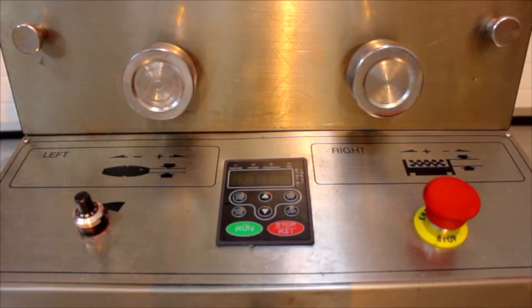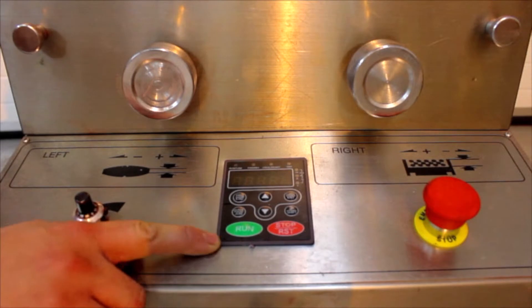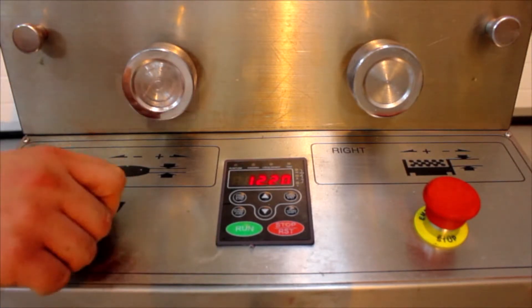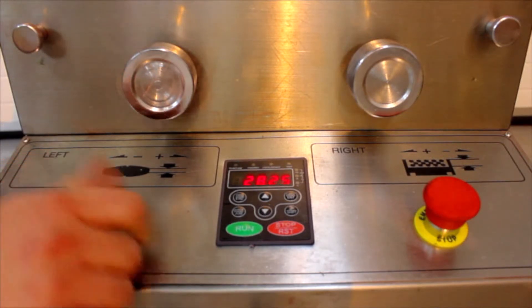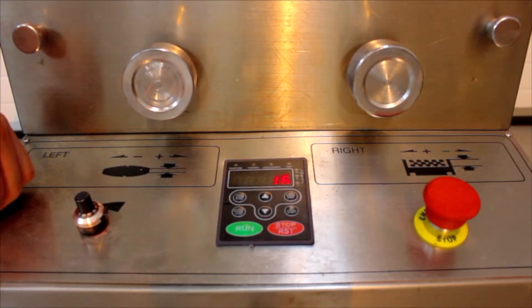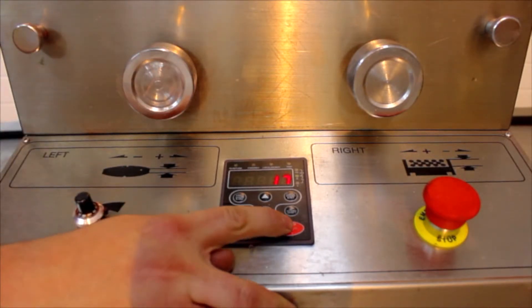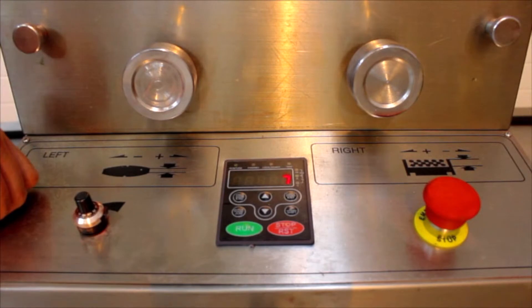Here you can see a close up shot of the RTP 9's control panel. The RTP 9 is controlled by a small electronic interface which allows you to adjust the speed, run the machine and stop the machine, all at the simple press of a button.